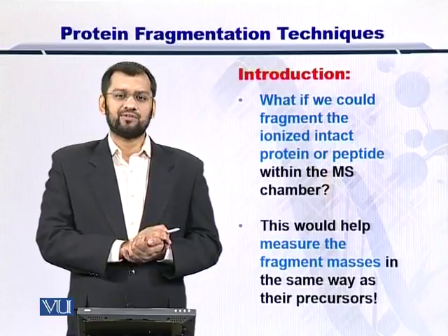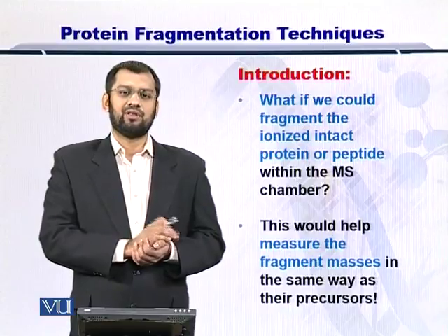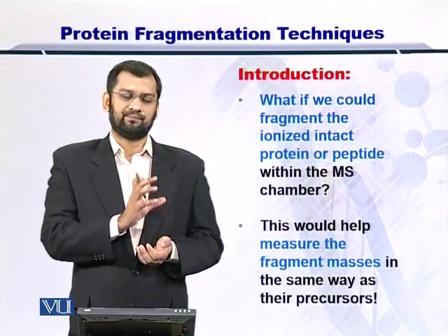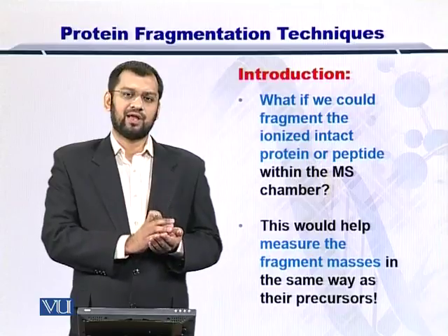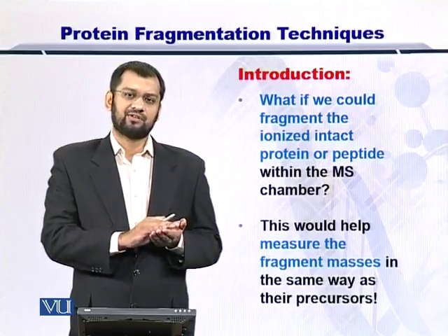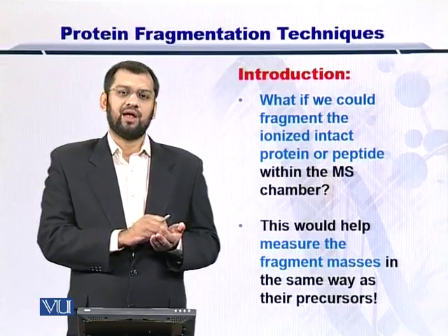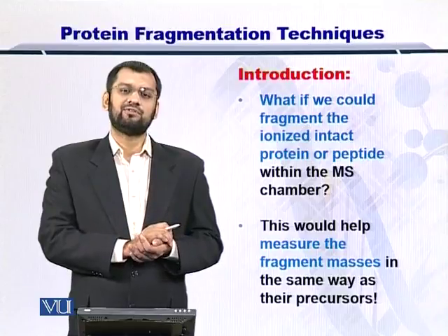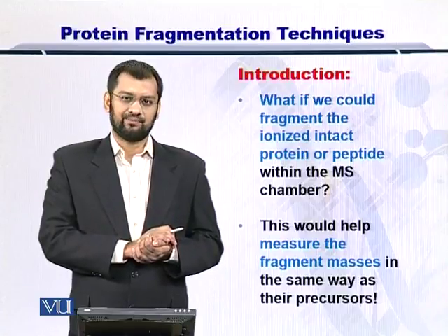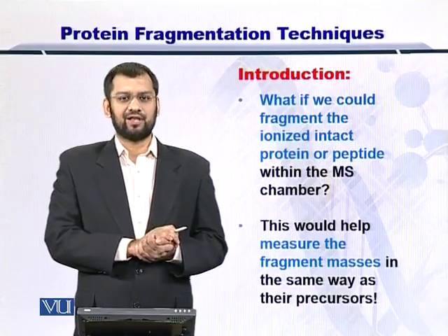It's a very interesting question. For that, people have created mass spectrometers with an add-on utility. That instrument detects the mass over charge ratio of a specific molecule and then allows for its fragmentation as well. So this can be extremely handy if you want to do further analysis.